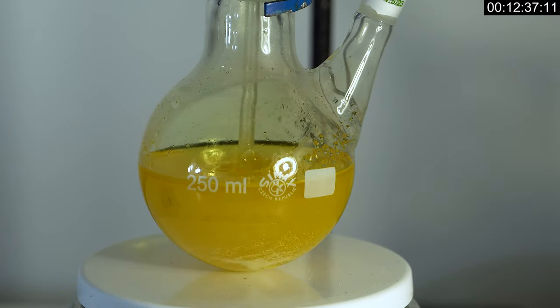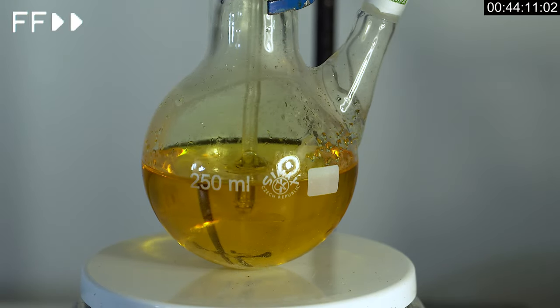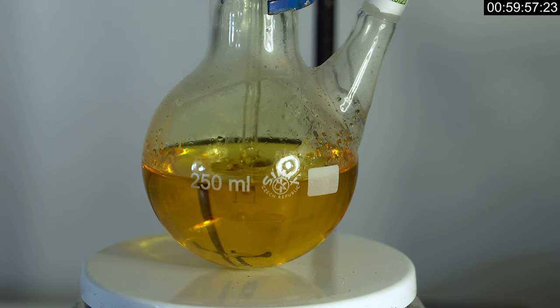In about an hour, all of the lead dichloride dissolves in hydrochloric acid, and we get a light brown solution of chloroplumbic acid.